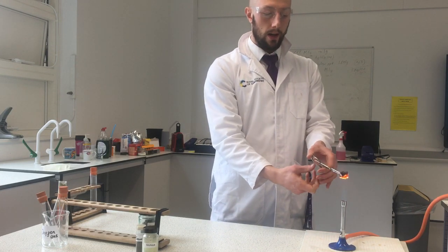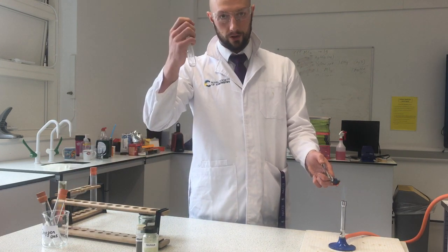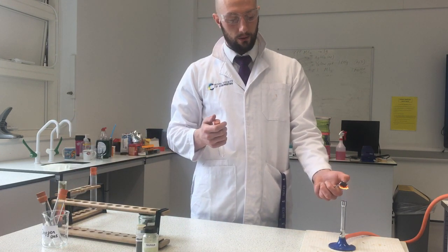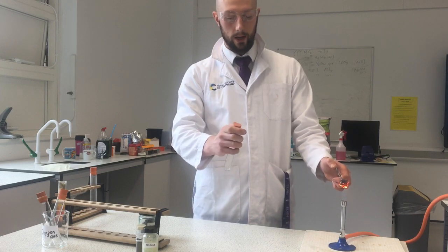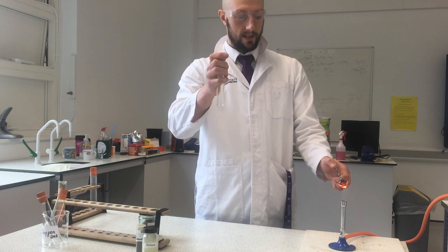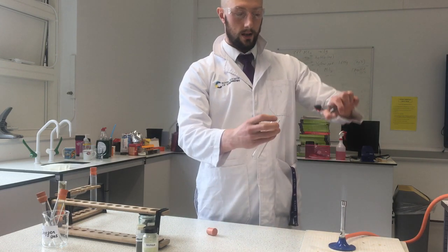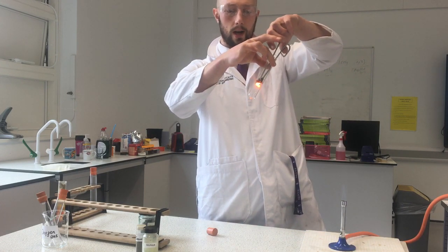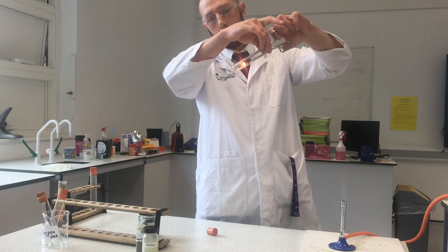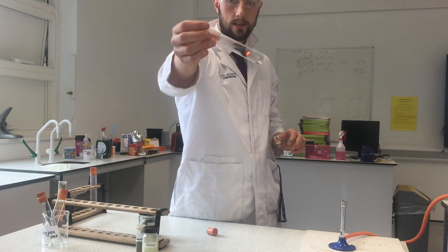Now the air that we breathe, the air around us, is 20% oxygen. I've got some pure oxygen here, so that's going to give us much more of a reaction. So I'm going to make sure that my steel wool is super hot here, and then I'm going to take the bung out of my oxygen gas and put the steel wool in the oxygen gas. Look at that. Woo, straight away we can see it there sparking, burning, good reaction in the oxygen gas.